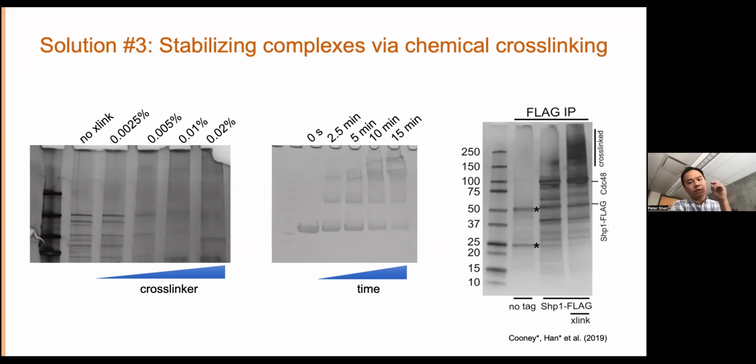Again, the reason is really to protect particles just before they're blotted and plunge frozen, right? They're probably fine and happy in solution for a certain period of time, but it's really that act of blotting and particles colliding with the air-water interface that causes particles to break up. And so by adding the cross-linker just before blotting and plunge freezing, this provides some level of stability, which I'll show in the next slide. And do I have a favorite quencher for cross-linking? Yeah, we just use Tris.